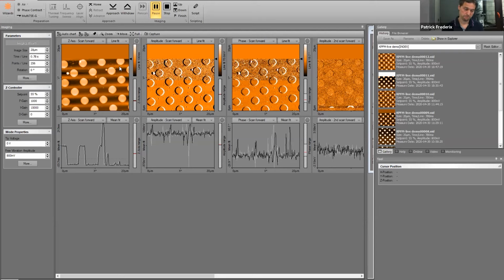If it's insulating powder particles with an insulating layer in between, it may prove difficult to measure KPFM. What you still may be able to do is switch off the KPFM feedback and just look at the lock-in response at the voltage, because the voltage of insulating particles may well exceed the 10 volts that we have for the KPFM feedback.